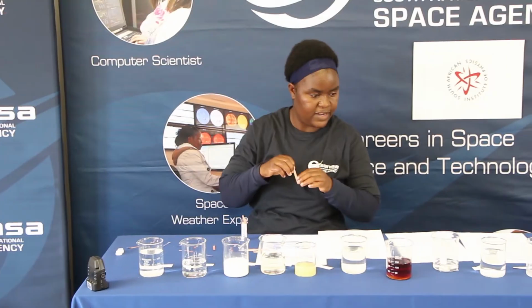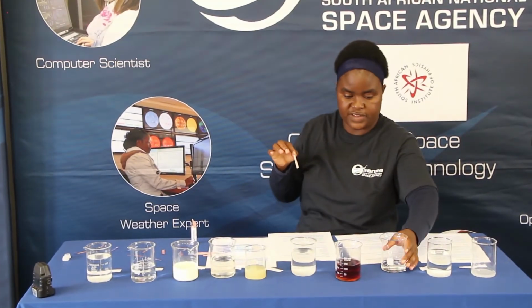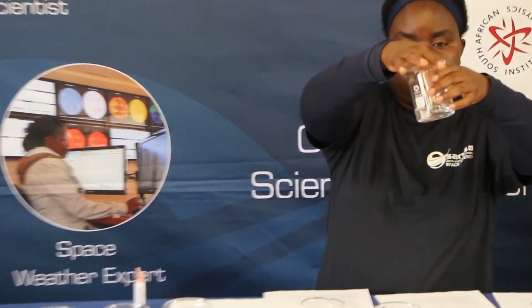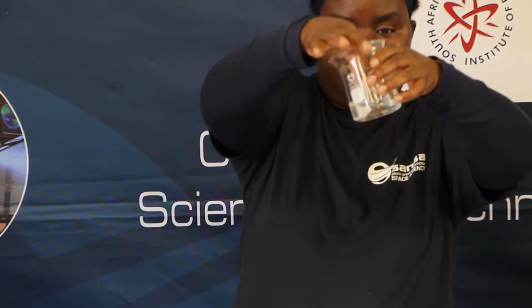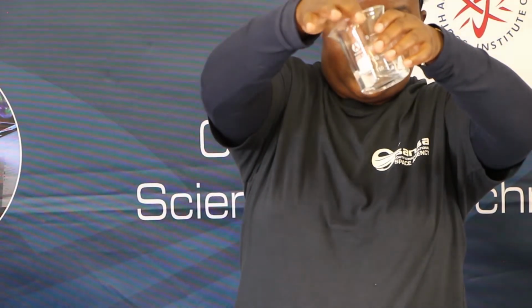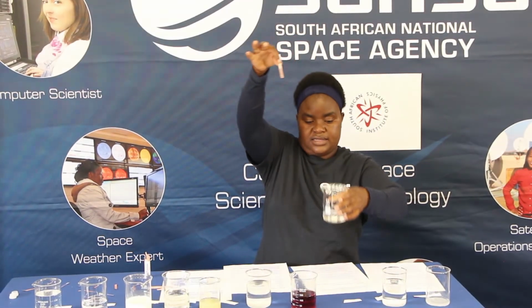Okay. And then the next one is the vinegar solution, which is over here. Observe what happened to the paper. If you put it in the vinegar solution, you see, it's still the same, no change.